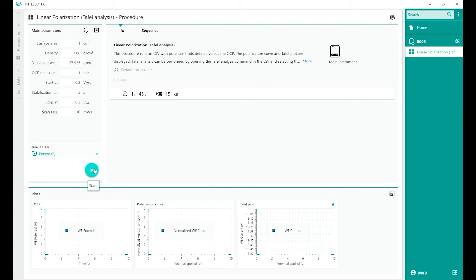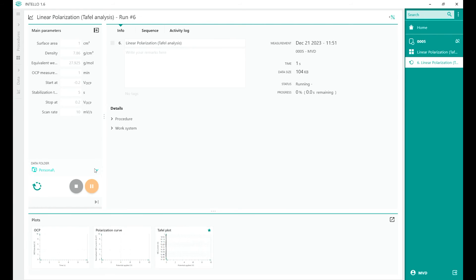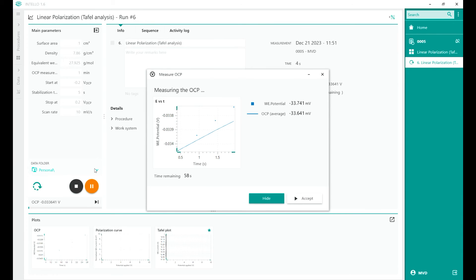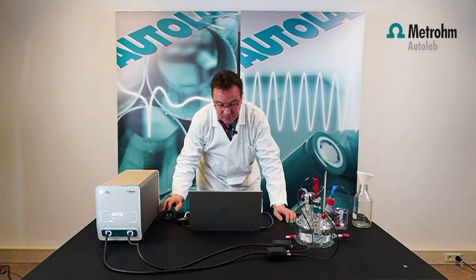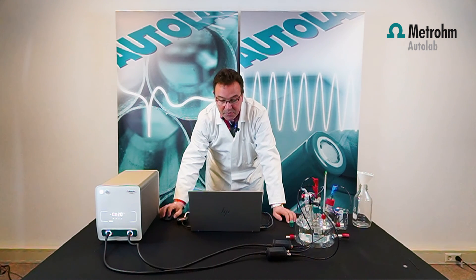First, we press start. The OCP is measured, so we're measuring the OCP with respect to time. Normally you do this for a very long time, but for this video we're going to decrease that time and just accept the values which we have. We accept the OCP value. Be sure that the Luggin capillary is close and the reference electrode is connected. We can accept the OCP value.